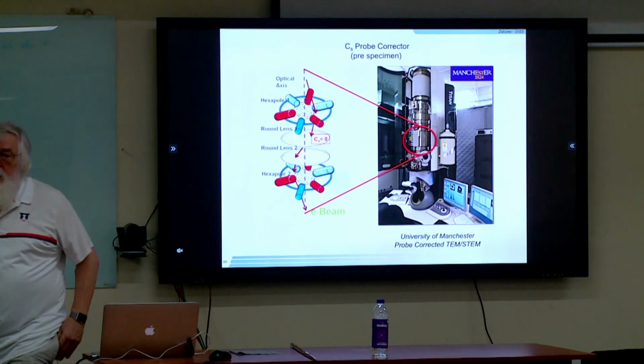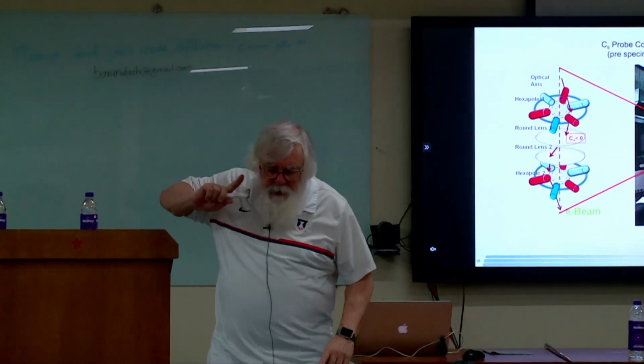Question? Yes. CS unit is, I'm sorry, wait a minute. I got to get a little closer because I don't hear well. CS unit is mm or micrometer, you have given. What does that actually mean? Where does that mm come from? Millimeters? In the microscope, I must.